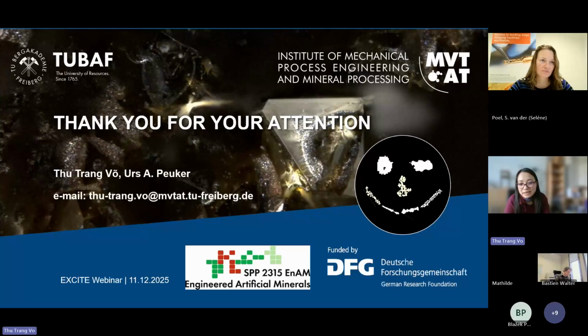If your sample breaks at, I don't know, 500 Newtons, then I would say it's perfect. Also, you can set the force onto a certain level, and it will hold the force as long as you want. It's flexible.